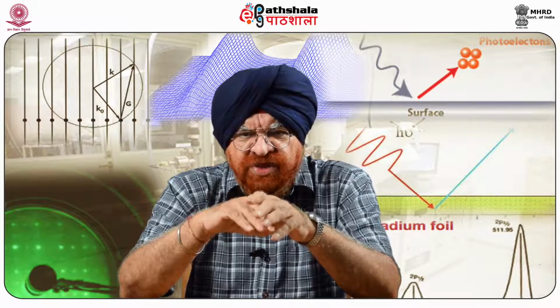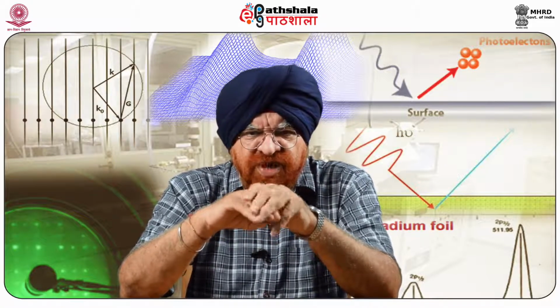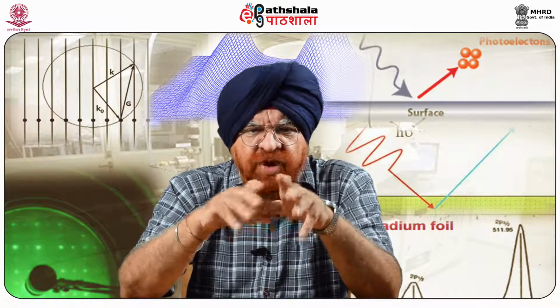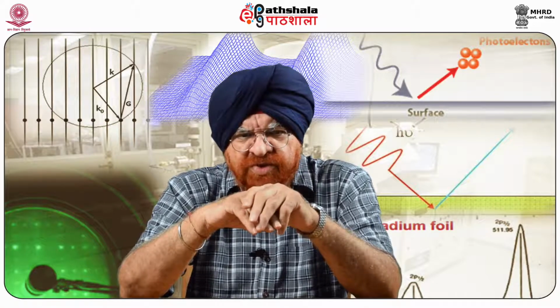Bacteriophage cell sheaths and porin vesicles, but with limited resolutions, have also been studied. Model membranes such as Langmuir-Blodgett films of cadmium arachidate have also been imaged very precisely.